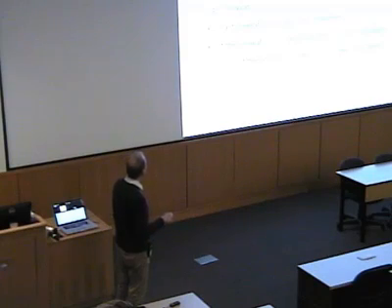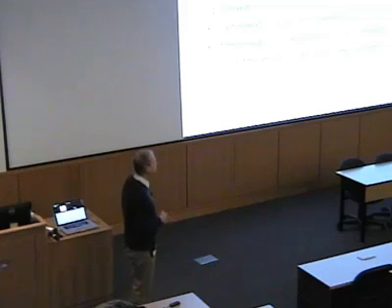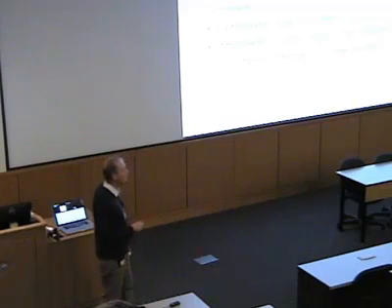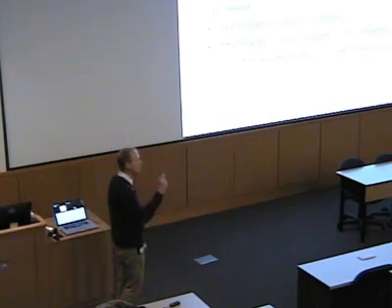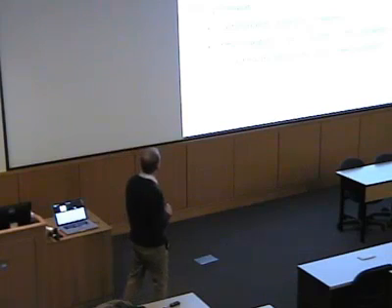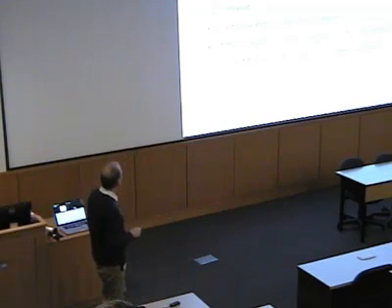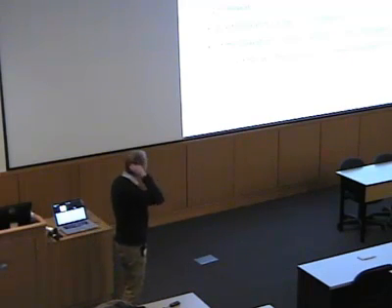That number turns out to be about 10 to the minus 3 for a magnetic field of 330 millitesla, or this would correspond to an X-band spectrometer. So we're trying to measure a very, very small population difference here because the energy separation is so small between the two levels.